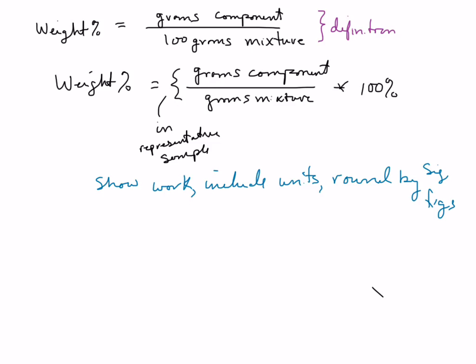Then you're going to separate it out, after you have a good tare weight on these, into your 3 boats. And then you're going to weigh those boats back. You weigh them empty and you weigh them with their contents. Then there's a place on your data sheets to do a subtraction, and by subtraction, you can come up with the mass of each of your 3 components.